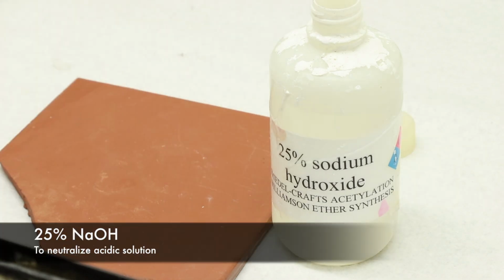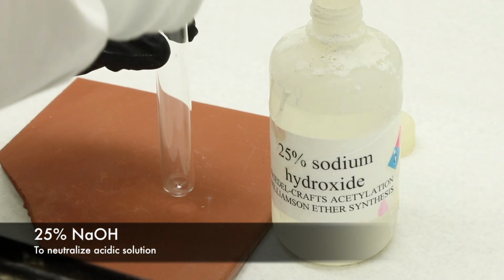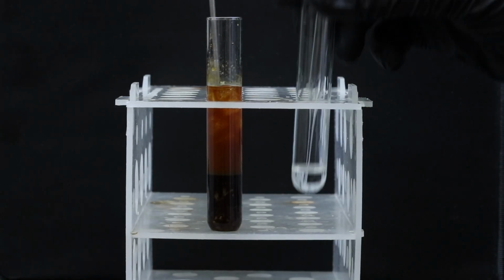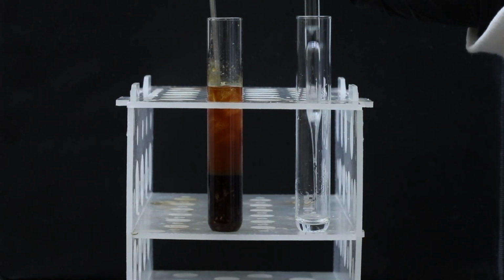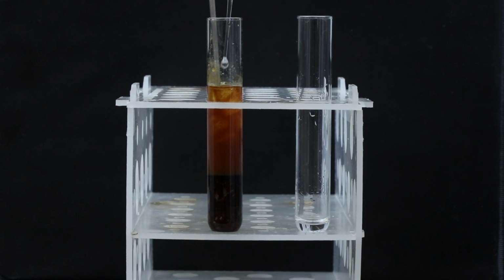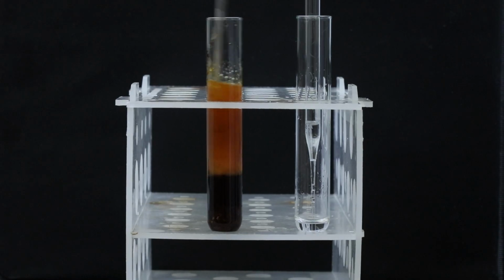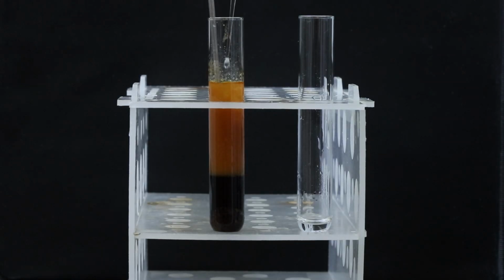Now I can get the sodium hydroxide to add to that solution and begin neutralizing the acids that were produced. And I'll want to stir that solution once adding the base to make sure that it reacts with all of the acid in there.